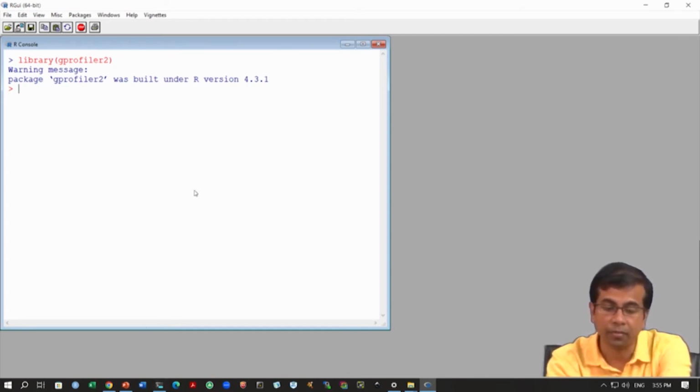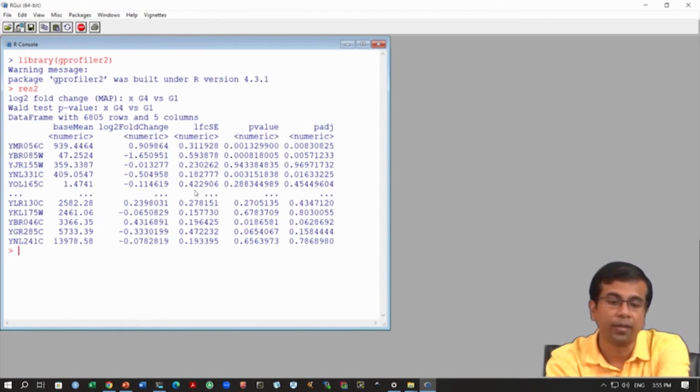So, the list of genes that we got, we can perhaps choose at least some of these genes and create a list and then give that list for this analysis. I am choosing these genes randomly, we do not have time to find out which genes we will choose because sometimes that requires a lot of careful consideration, identifying those genes that you think are important after those filterings, log fold change, and so on.